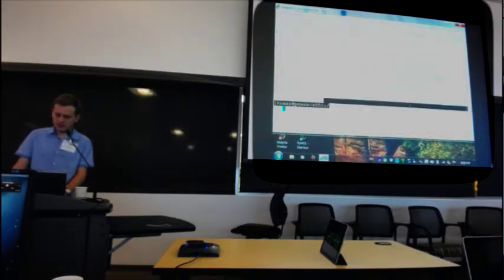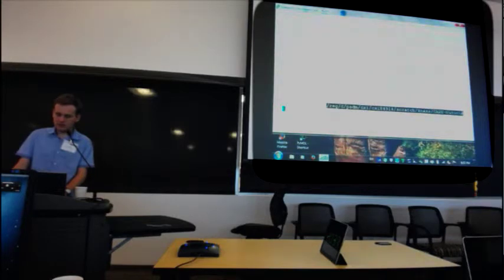Exactly like this. Your username, CASS tutorial CASS.